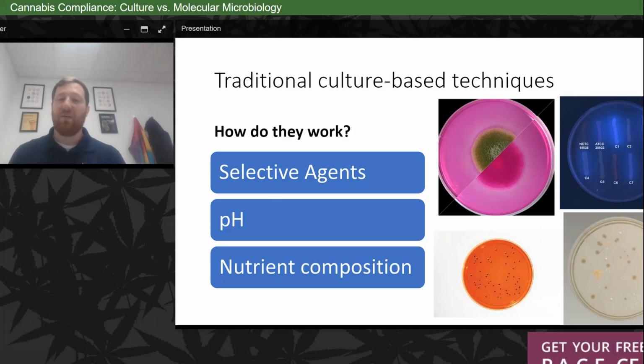target organisms. So when we look at this, it's actually my favorite plate, the top left corner here. It's DRBC. That is a selective media that allows for just total yeast and mold. Underneath it, you have XLD. To the top right, let me go to the bottom right first. That is just tryptic soy agar, TSA. It's just a standard plate count. So that agar will grow everything. It corresponds to what we would call an aerobic plate count or a generic plate count. So there are no selective agents, no differential agents in that media. It grows everything that we want.